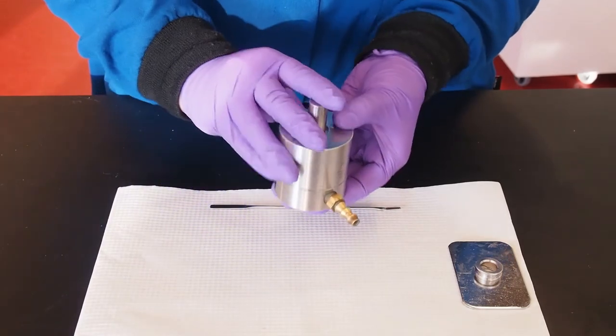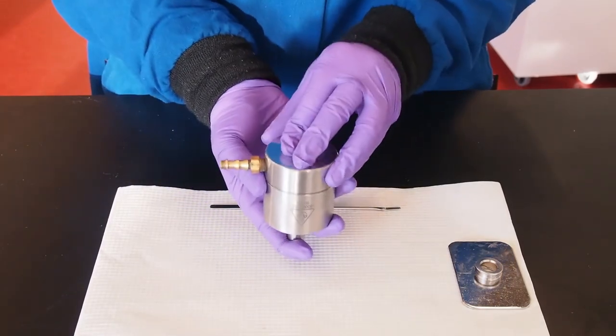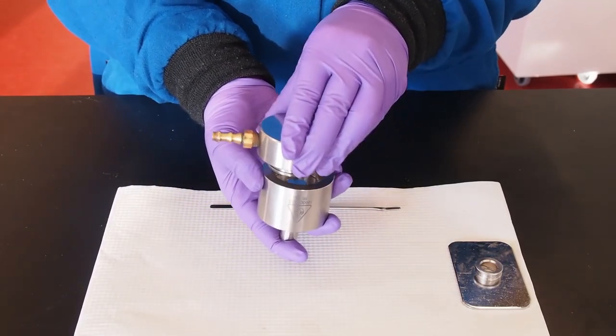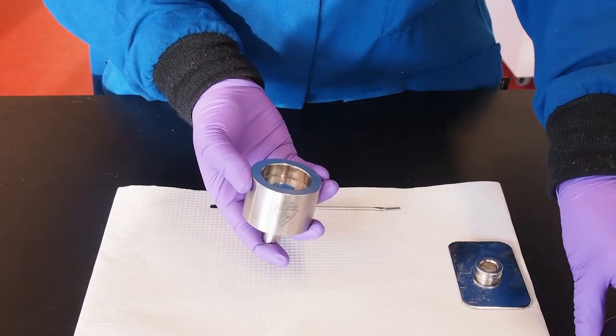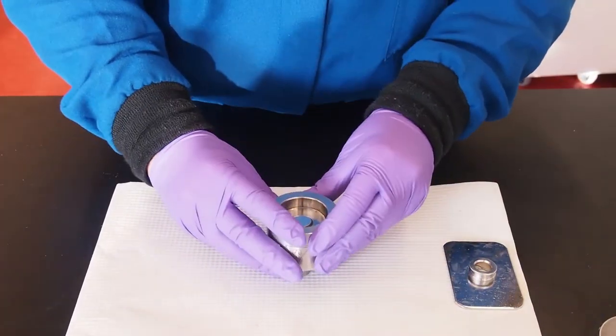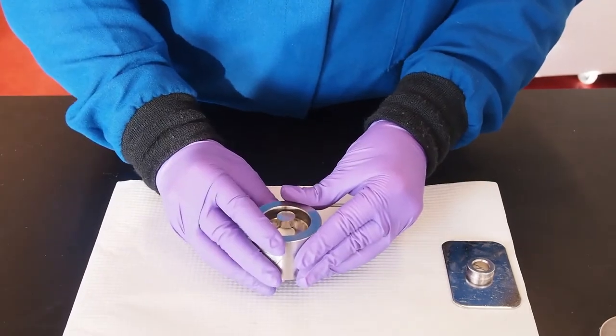While carefully holding the anvil in place, rotate the press upside down and place it onto a clean paper towel. Remove the base and carefully extract the pellet by lightly tapping the die onto the tabletop.